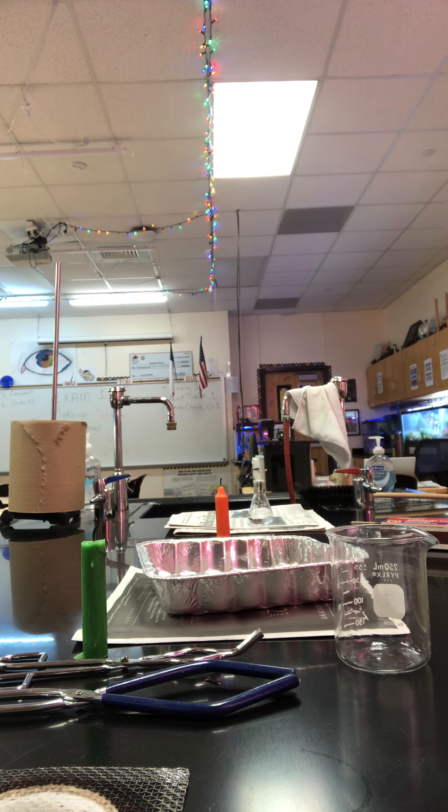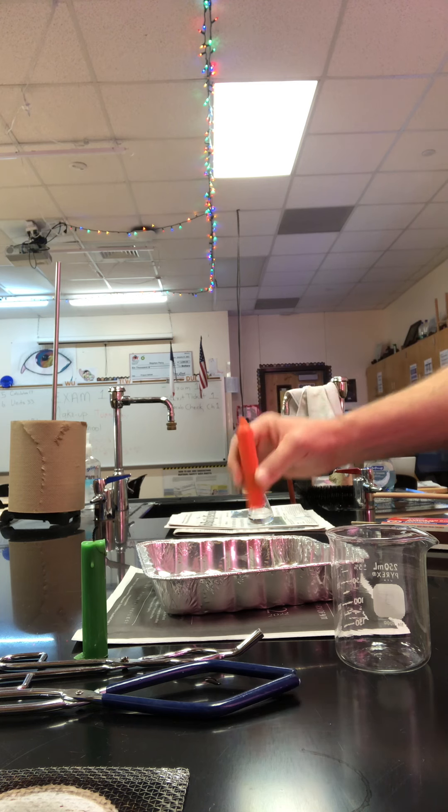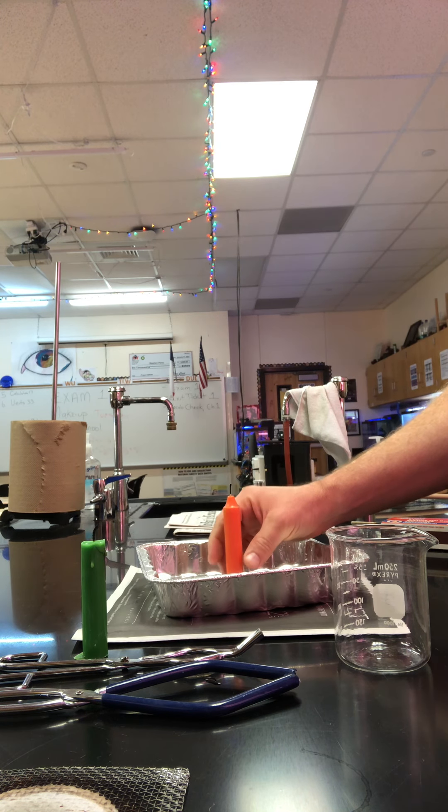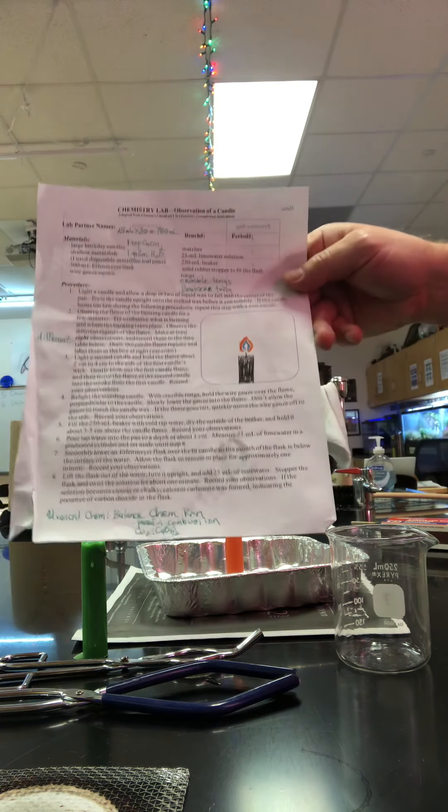The first thing we're gonna do is light a candle, use the wax of the burning candle to kind of glue the candle down in place. The second step says to observe the flames. So you need to watch the flame, draw your own beautiful picture like I did here, and on number two on the back you're gonna put eight observations of your flame.